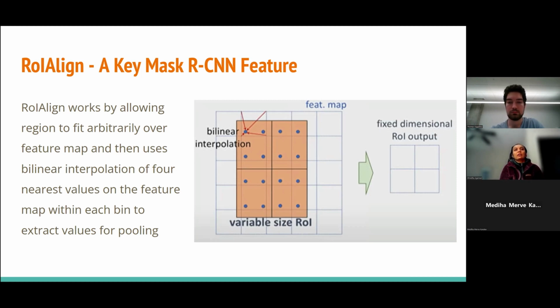Right. So I think it makes sense. That's why they apply this simple algorithm and just try to extrapolate, because sometimes even such interpolation we also lose, because with the ROI we are getting only the center of the cat, but the rest it's trying to just extrapolate. Yeah, I think that was the thing. At least when I saw people present, I was watching some videos of people presenting Mask R-CNN for the first time 5 years ago, and they were really proud of this feature. I think this is what they're saying, oh, this is the thing that makes ours a little more accurate than anything beforehand.